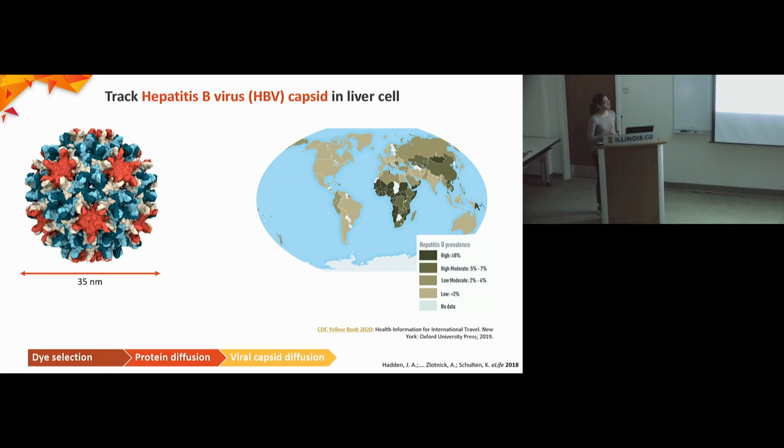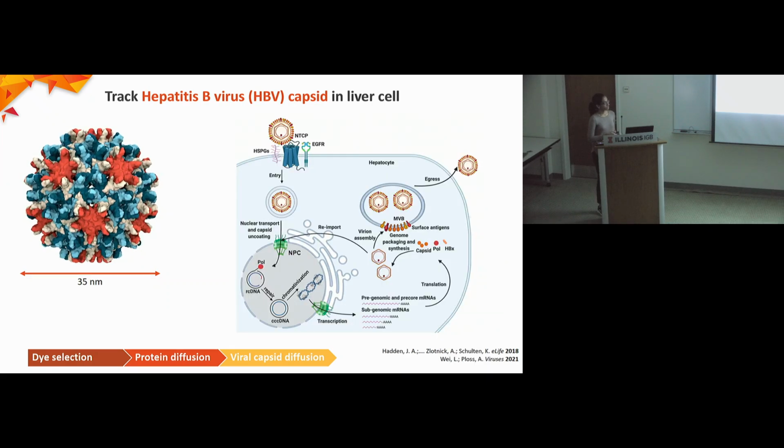And so we think that with our instruments, both in the lab and using MINFLUX, we'll be able to answer certain questions that are crucial in terms of how the virus actually attacks a cell and how the life cycle happens inside the host cell. So this is a very schematic summary of a typical life cycle of hepatitis B virus.